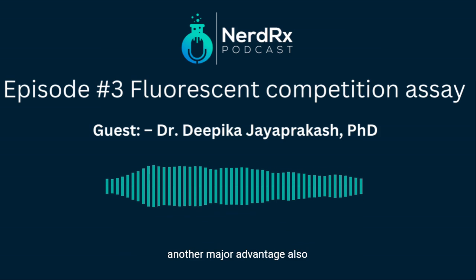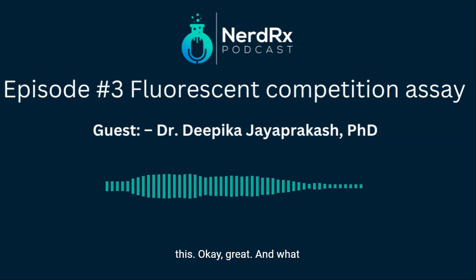Another major advantage is that it is compatible with high throughput screening. Since we are utilizing flow cytometry, that will accommodate a plate. You could easily do it in a 96 or a 384 well plate format, and that easily works for this.